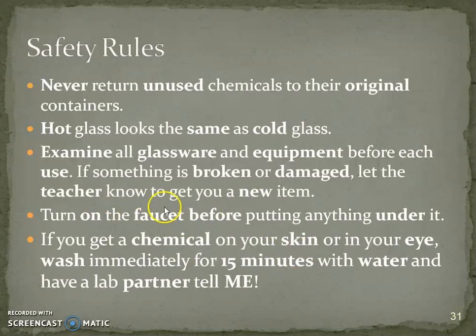Very important: please turn on the faucet first before putting anything underneath it — the water is very high pressure. If you get a chemical on your skin or eye, you're going to rinse it for at least 15 minutes, and remember to have a partner tell me.